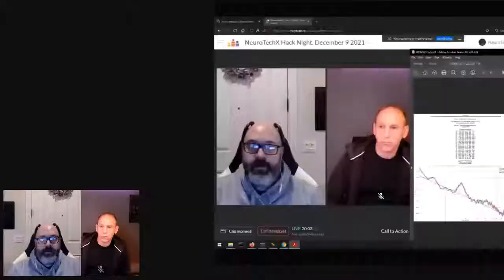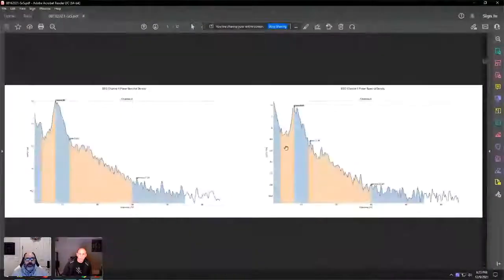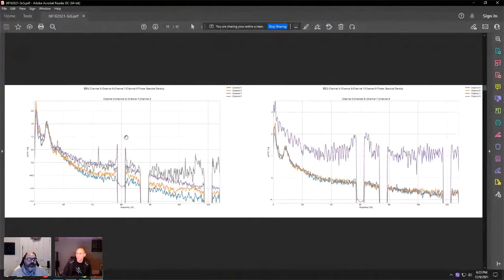And you can tell from the voltage when something is unusual. And again, like here, the power spectrum kind of indicated which electrodes are trustworthy, which ones are not. But in terms of, can you recover that purple signal? No, I wouldn't. I would just redo the experiment.